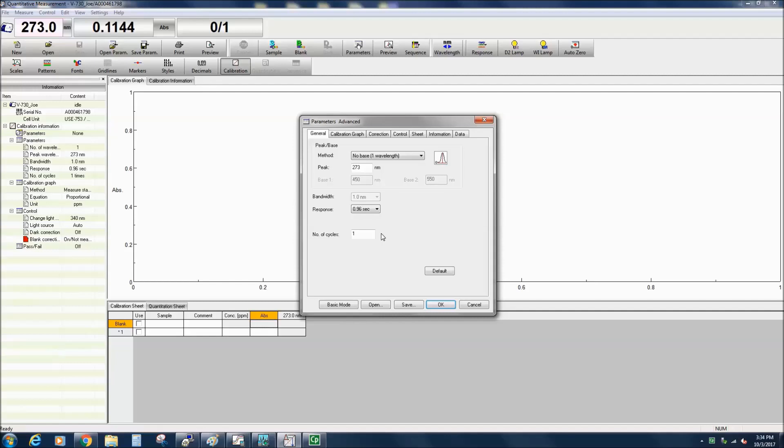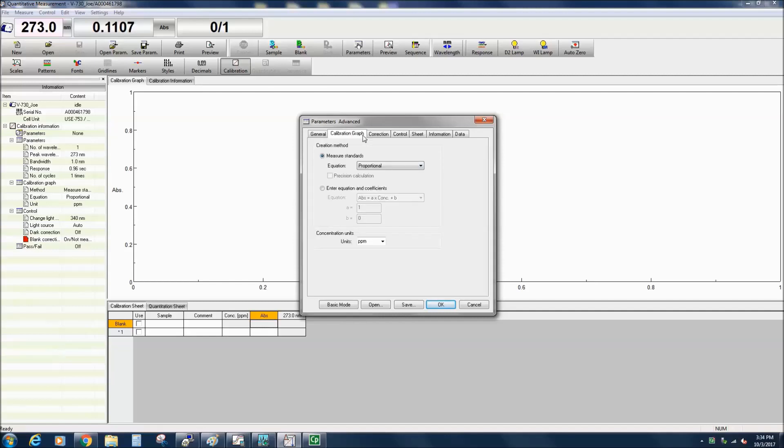In the Calibration Graph tab, you can specify the quantitation method and concentration units used for creating the calibration curve.